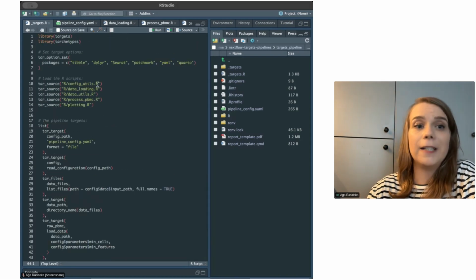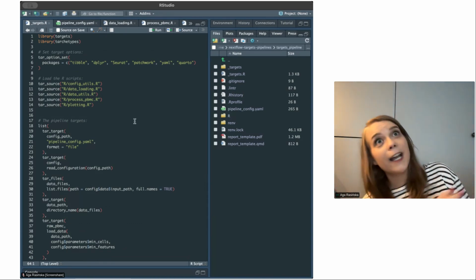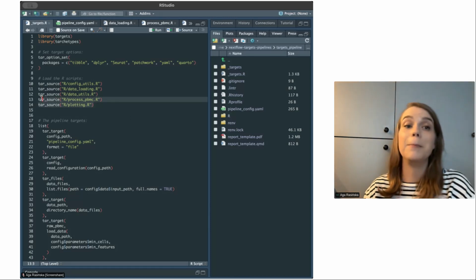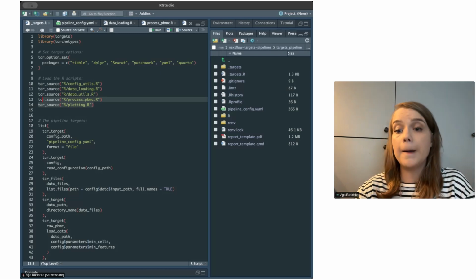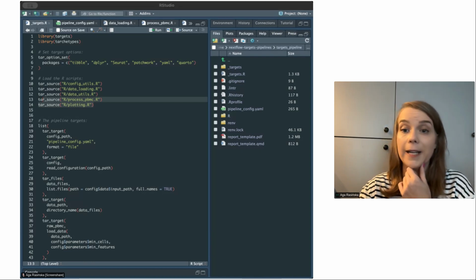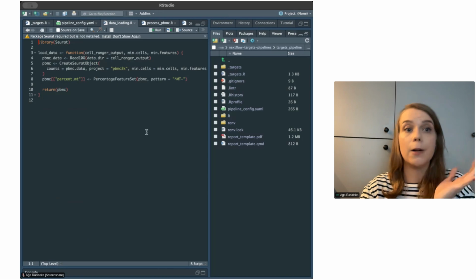Okay, so we have several steps over here, but if you listen to me carefully, I'm finishing on process PBMC, so I don't have any expression, or let's call it find markers steps. So yeah, it would be good to add it so we can actually have it. So let's see what we are missing in terms of data loading.